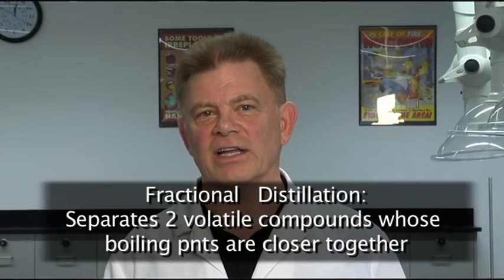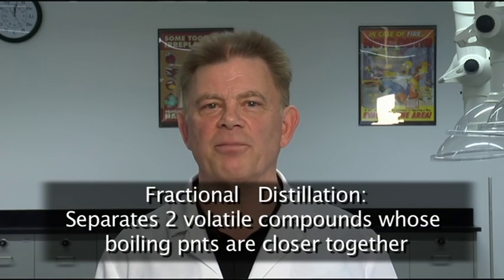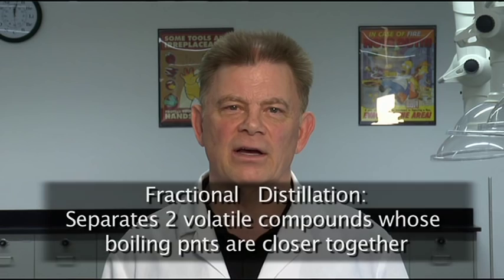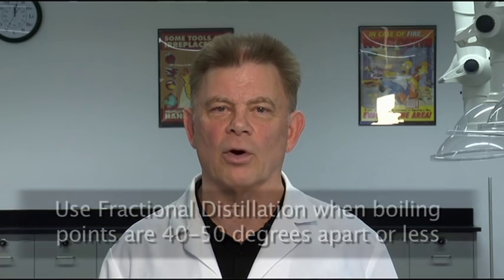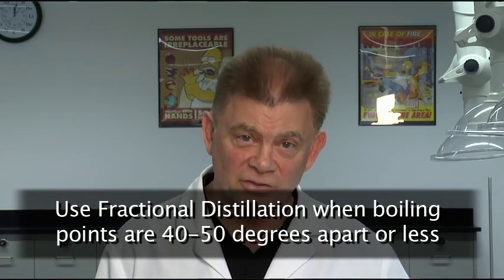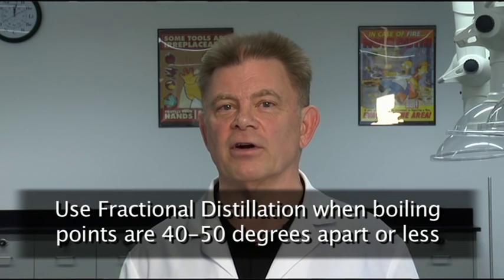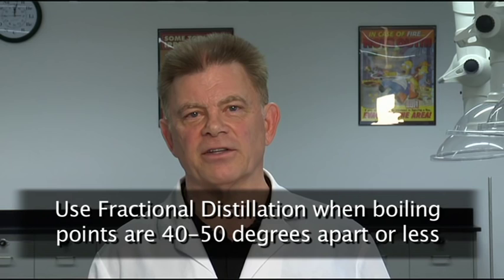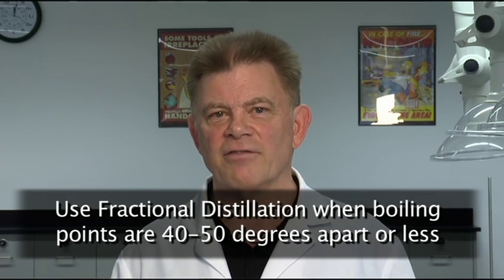In a fractional distillation, we have two volatile compounds whose boiling points are relatively close together, and that means within 40 or 50 degrees of each other. You probably want to use 40 or 50 degrees or less, you want to use a fractional distillation over a simple distillation. In our laboratory, in our experiment, we're going to separate toluene, which has a boiling point of 111 degrees, from cyclohexane, which has a boiling point of 81 degrees. So the difference in temperature between those two boiling points is around 30 degrees, so we need to do a fractional distillation.